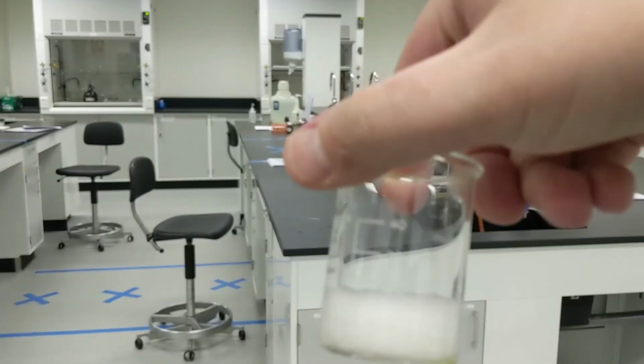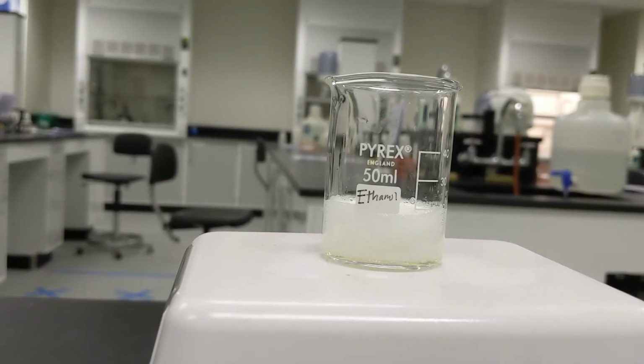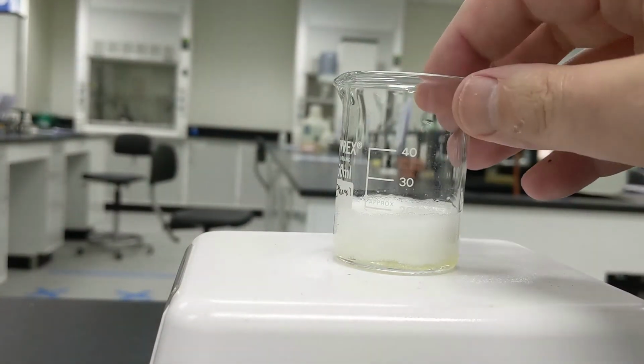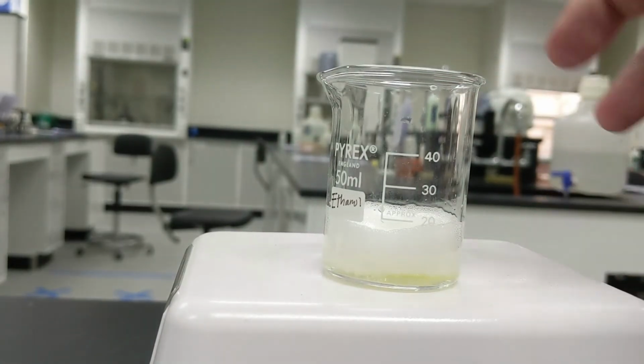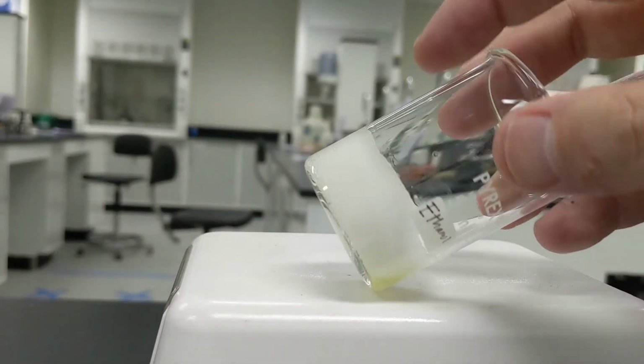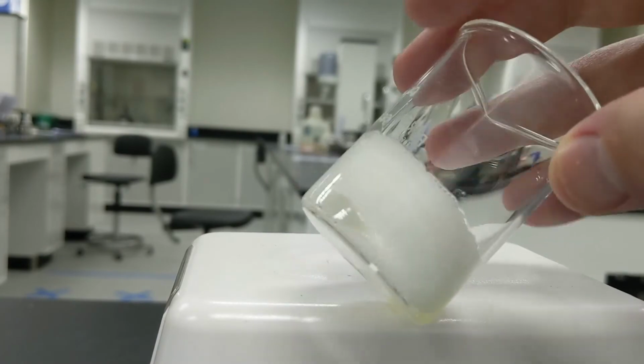But look at the difference of what I started with compared to what I finished with. The volume alone has almost quadrupled. It's almost 20 milliliters of volume, but you'll notice it's mostly bubbles of air.